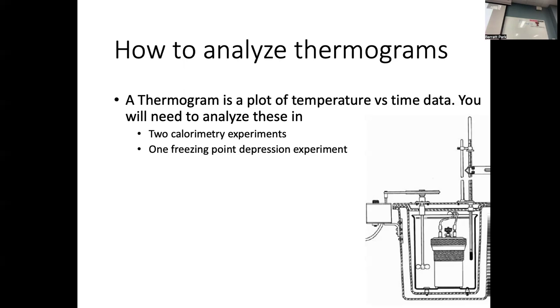And you're going to look at, I think you're going to measure the heat of reaction or the heat of formation of naphthalene. And so basically the way you do that, you set up a sample of naphthalene inside of this vessel here. The vessel's filled with oxygen. There's a wire coming out of the vessel that's attached to an ignition, which you ignite the wire. It initiates the reaction.